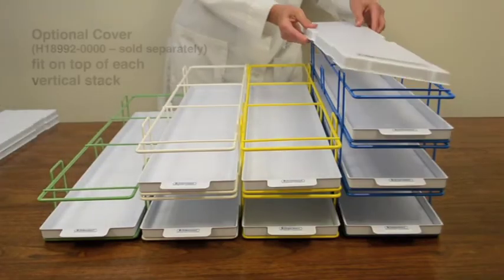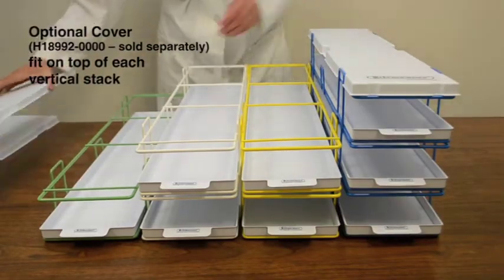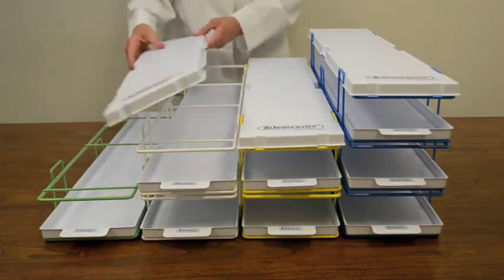If desired, optional covers can be placed on the top of each rack frame to provide additional shelf space.